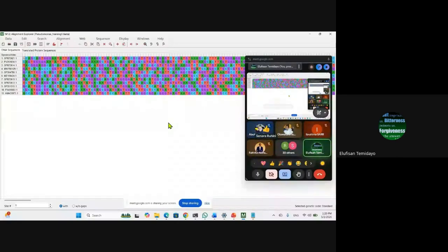So now I'm going to do an alignment for this. This is what it gave me. These are their accession numbers, so I don't know what organism they are. I may have to go and look for their names and fix it later. But let's just work with this, and then we can talk about how we will assign their names.